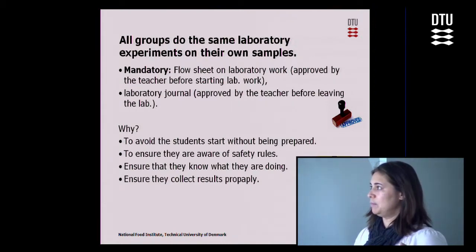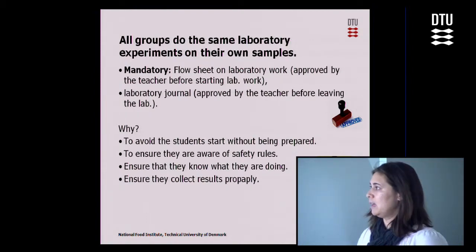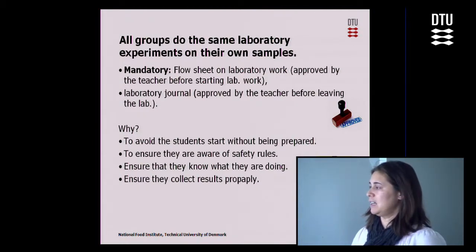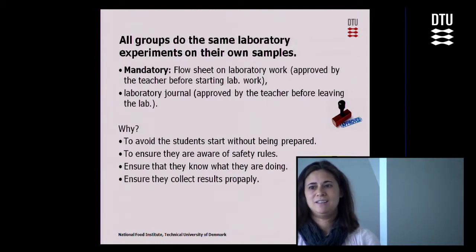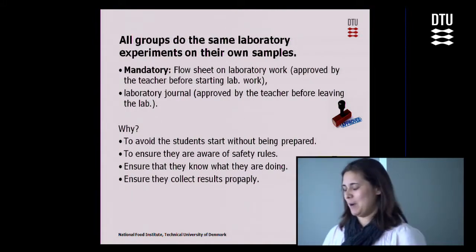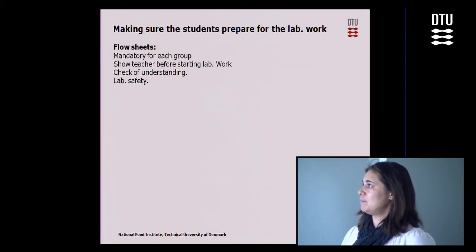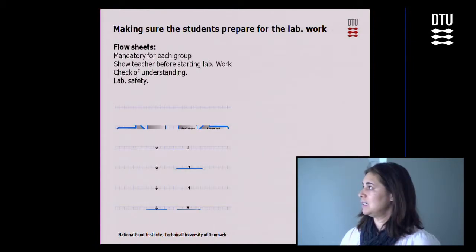We want them to be assured that they're aware of safety rules. We work with bacteria, it's very important. We want them to ensure that they know what they're doing, and that they collect the results properly. If they don't, the other groups will not have anything to work from, and then the whole way we work will not work. So we make sure that they are prepared, and they make these flow sheets, mandatory for each group, and they show them to the teacher, and we check for understanding and lab safety.